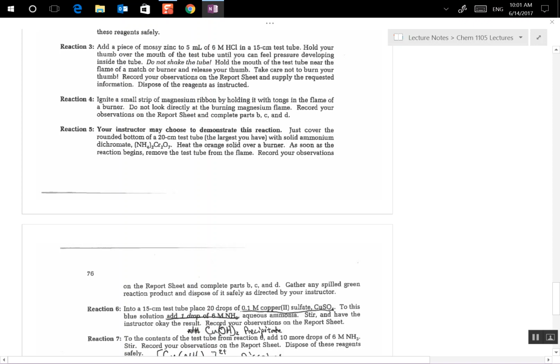Because if you look at it, like you will because I just told you not to, then you're going to be like, whoa, I can't see for a few minutes. So I caution you, don't look at it. You don't need to. It's going to be exciting enough if you look at it to the side, but if you look straight at it, it's going to bother your eyes.